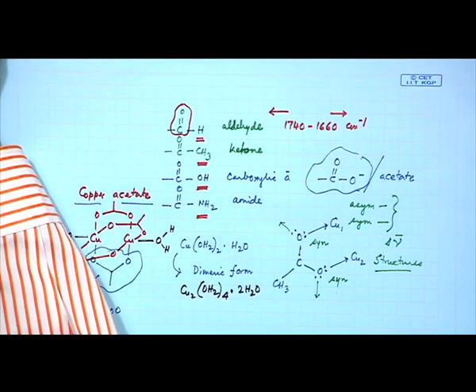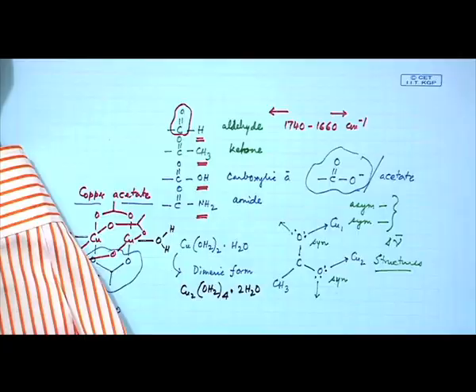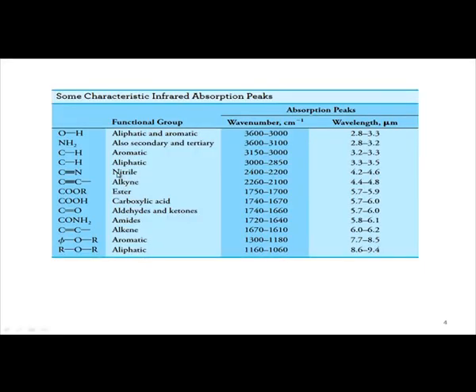So, we get this not only for this copper, but for all other very characteristic functional groups of the organic molecules, and some of them can be bound to the metal ion center. Just for a simple change, if we go from a double bonded structure to a triple bonded one, what will happen? You see the movement towards the upper range, that means towards 2260 to 2100 centimeter inverse when you go for the triple bonded one.